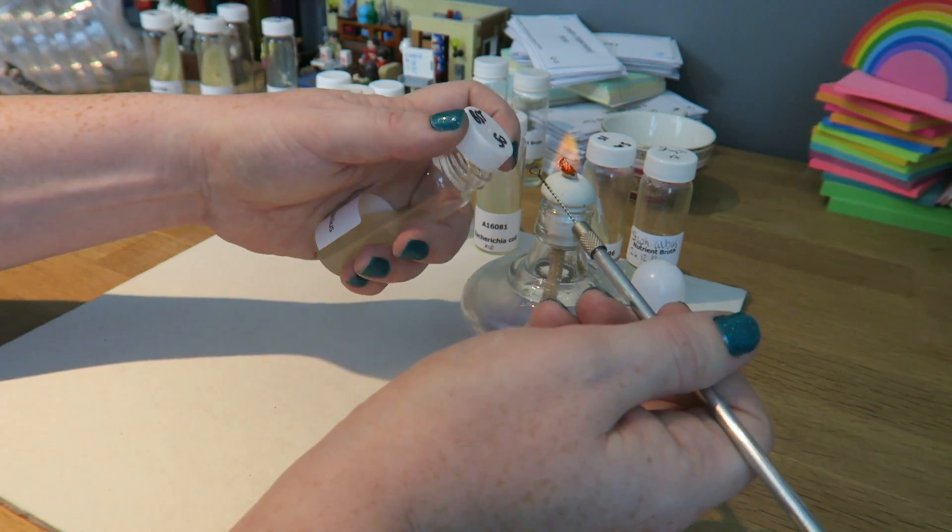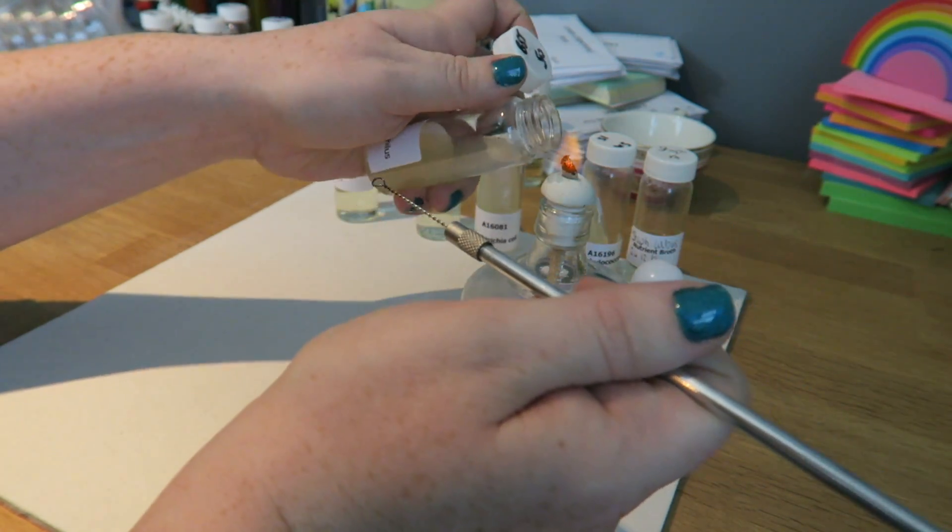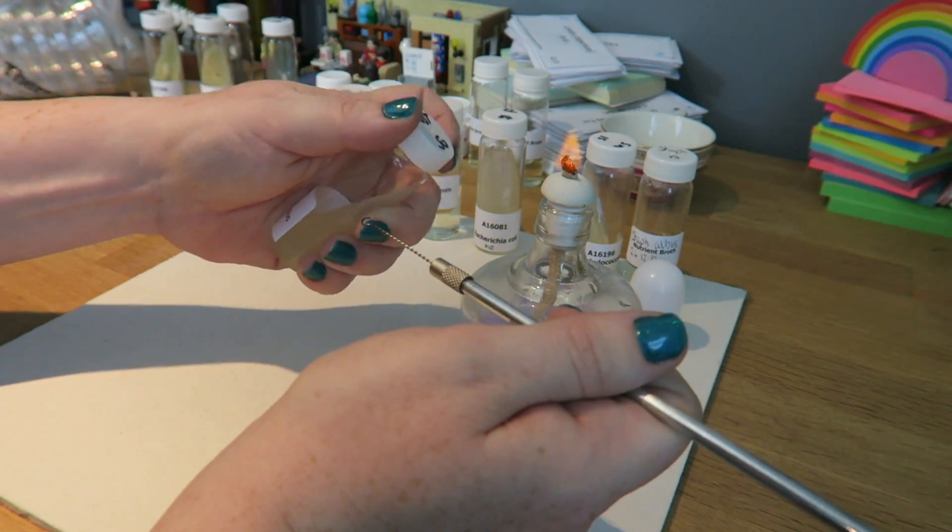So now I can take the lid off like that, flame the top, go in there, take a couple of cultures, flame the top again, and put the lid back on.